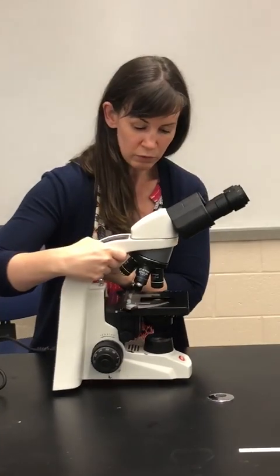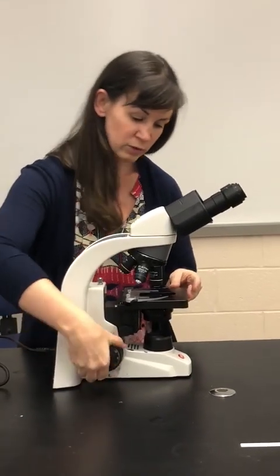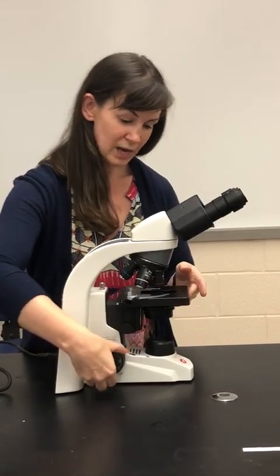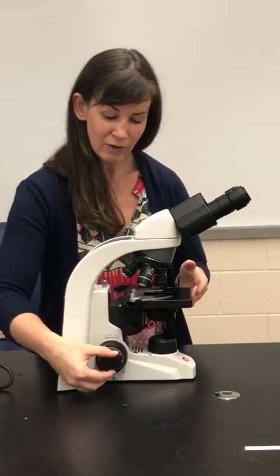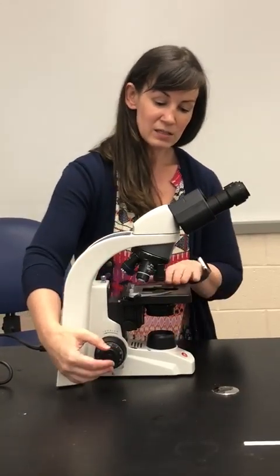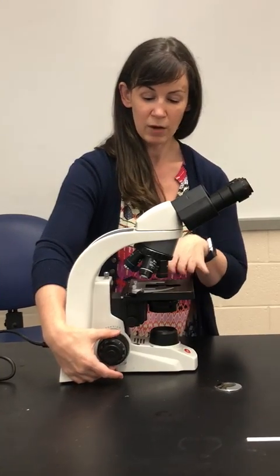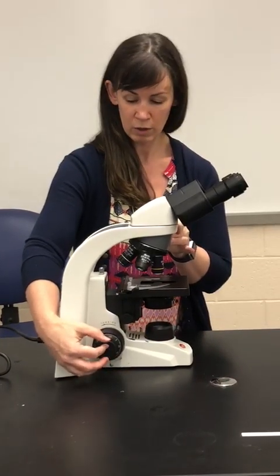We are able to move the stage up and down using our focus knobs. The coarse focus knob is the biggest one, and you can use that to raise and lower the stage large amounts. And then we have our fine focus. It doesn't visibly move the stage. When we are focusing something on the microscope, you only use the coarse focus knob when you're using the 4x objective. Once you've moved off of that 4x objective, then you only use the fine focus knob. And we'll talk more about that in a little bit.